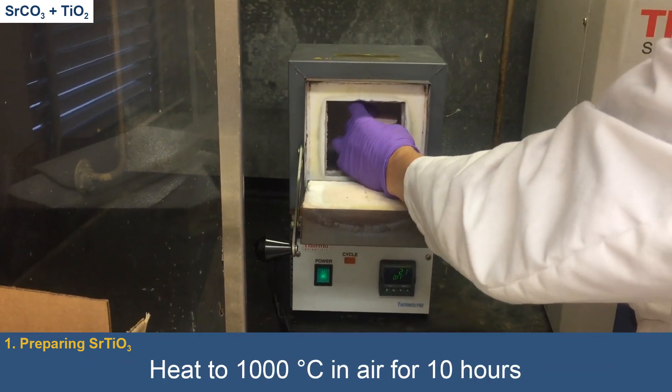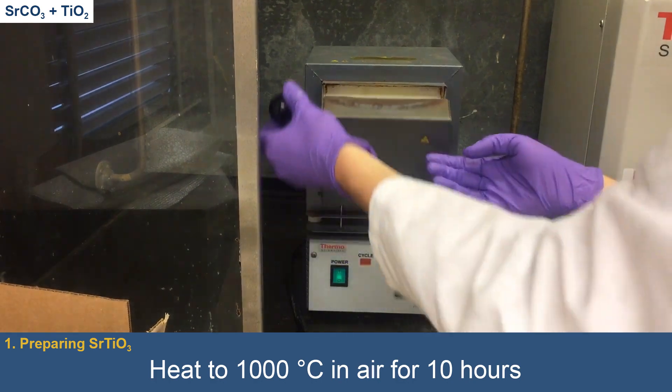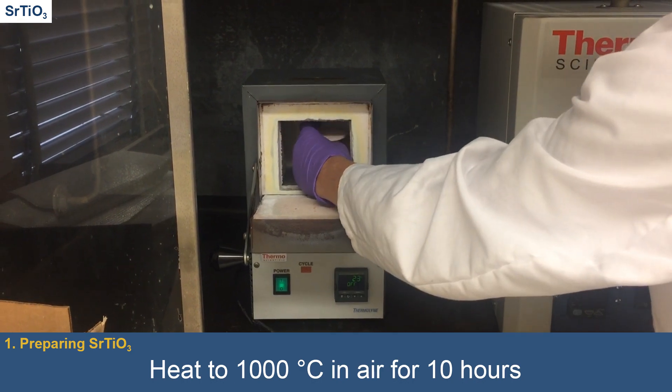The powder-containing crucible is then placed into a box furnace where it is heated to 1,000 degrees Celsius for 10 hours, with an initial ramp of 10 degrees Celsius per minute, yielding strontium-titanate powder.